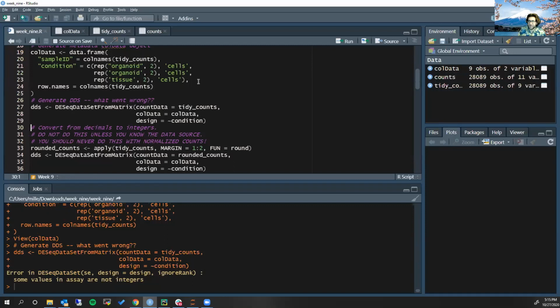Okay, just for a quick poll of the room, does anybody want to tell me what this error means? You can say it quite literally, but does someone want to take a guess as to what's causing this error? So Catherine says alphanumeric values.